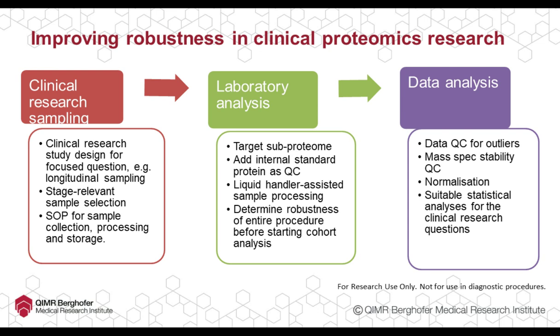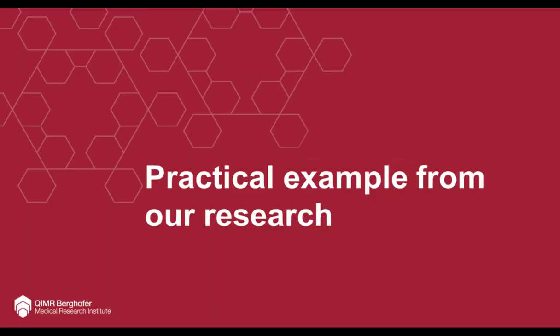inserted during your sample sequence to ensure the mass spec performance is the same across weeks or months of runs for your entire cohort. Normalization can be used as well, and finally, one should apply suitable statistical analysis to answer the clinical questions. So now, finally, I just want to share a practical example from our research.